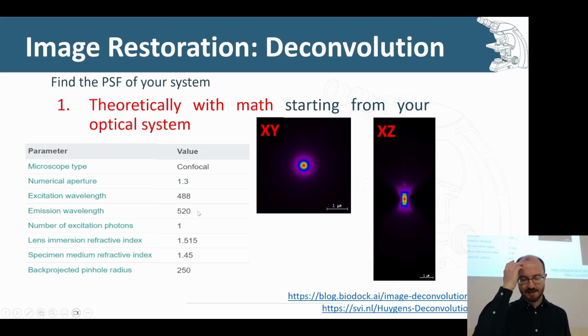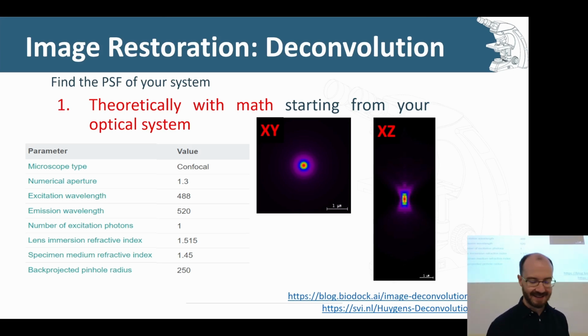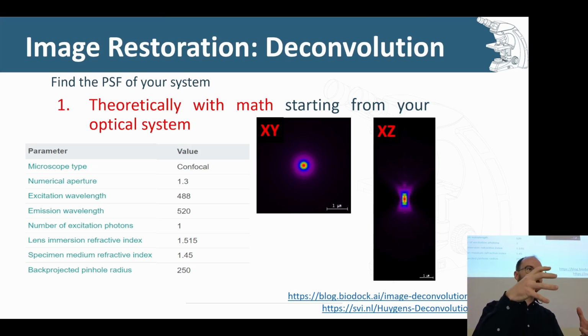I haven't really discussed this, but the rough principle here is that you put a fluorophore in your cell, and it binds to the structure that you're interested in. Now you need to shine a certain color laser on it. It's designed to work with a certain color laser, so if you shine that laser on it, it's going to be excited to a higher energy state, and then it's going to fall back to a lower energy state. That falling back releases some photons, and as these photons are released, we perceive them as a certain wavelength of light.